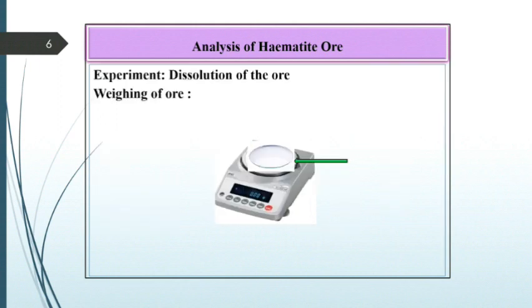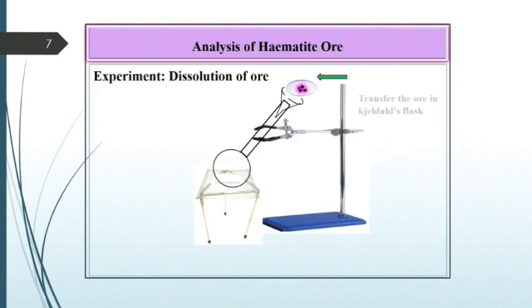For the analysis of hematite ore, we have to dissolve the ore. Weigh about 0.3 gram of ore on a watch glass and record this reading as W gram. Now transfer this ore in a Kjeldahl flask and add 7 to 8 ml concentrated HCl to it.